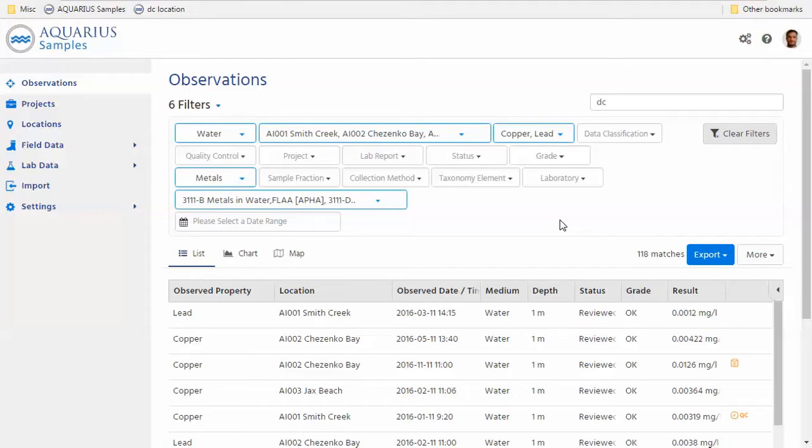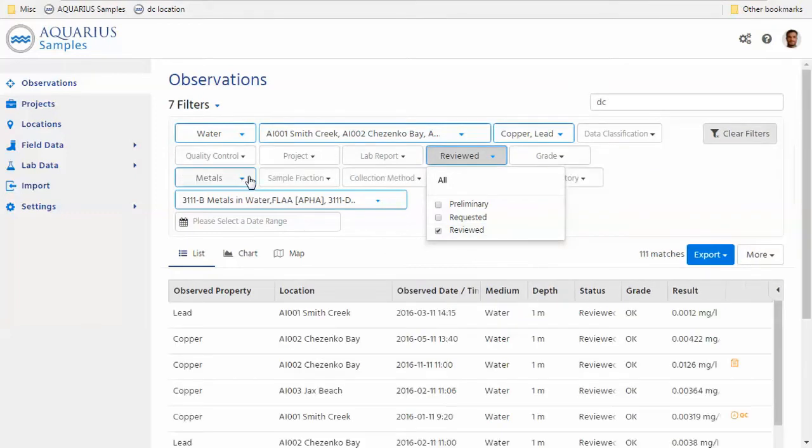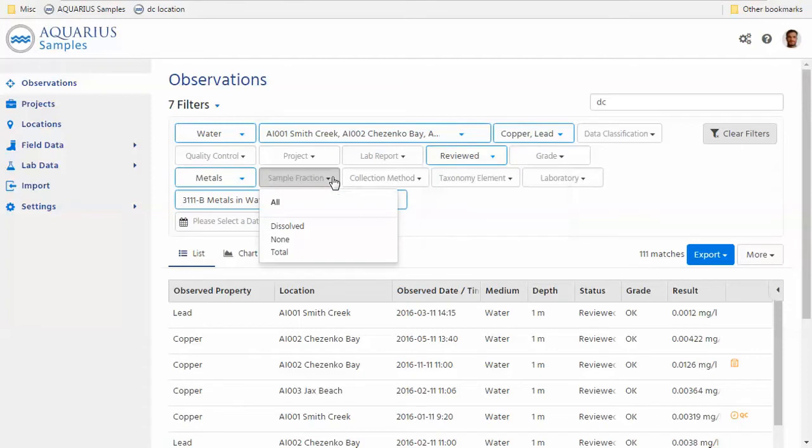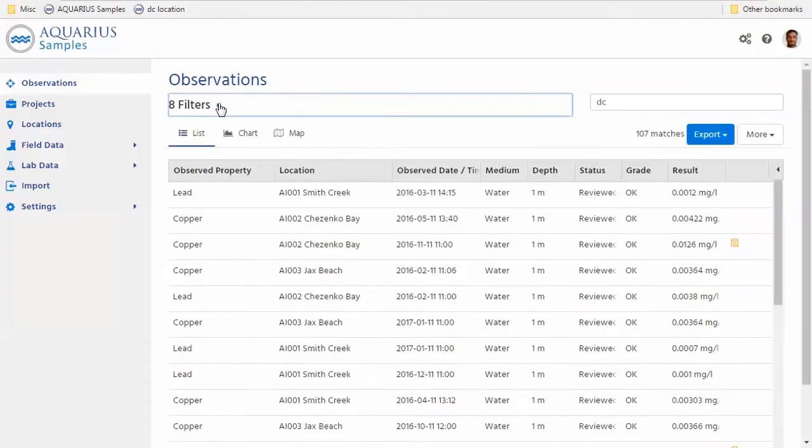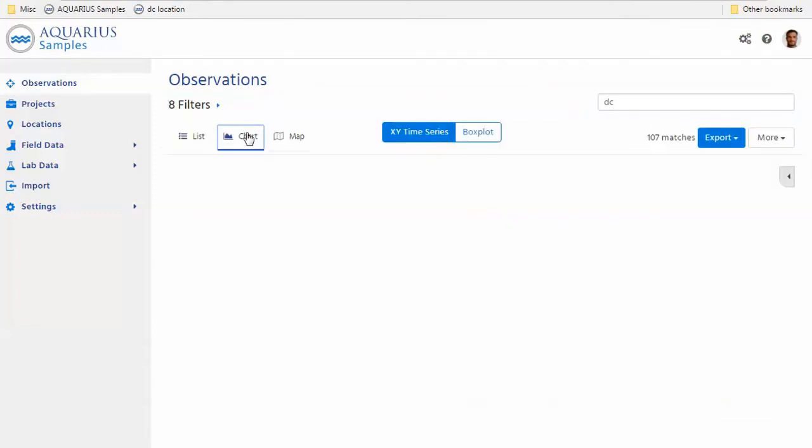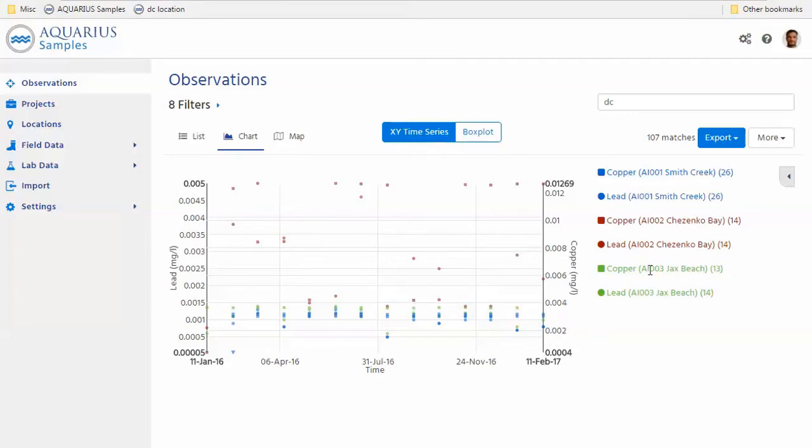Sure. Continuing with this project, we might be interested only in looking at reviewed data, meaning my initial QA and QC has been done. So I'm going to use the status filter to filter to data that has been marked as reviewed already. And maybe we're also interested in only using a specific sample fraction. So I'm going to filter it to total results right here. And again, you can watch the number of matches immediately adjust to the filter criteria I've just added. So let me bring up this data set after we are done filtering. Let me bring this up in a chart. That's all I have to do. Click the chart right there. And it's quite obvious that from just looking at this chart, there's something going on at this location, Chesapeake Bay, we got some elevated levels of copper and lead compared to the other two locations.